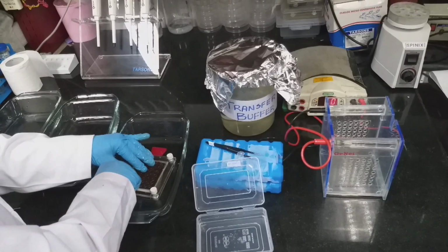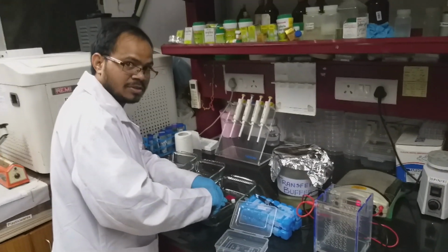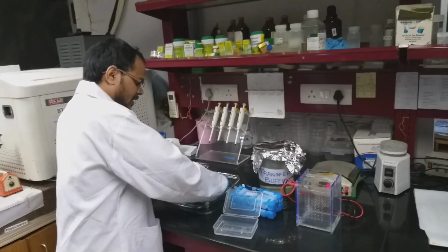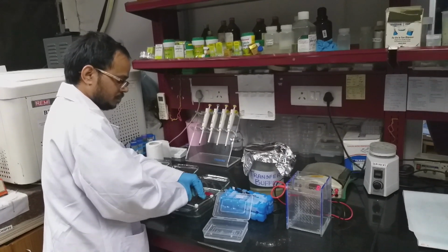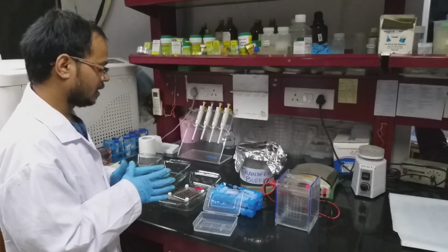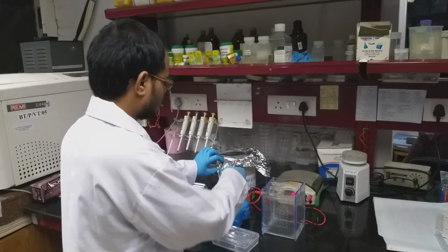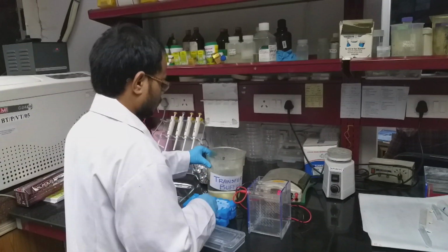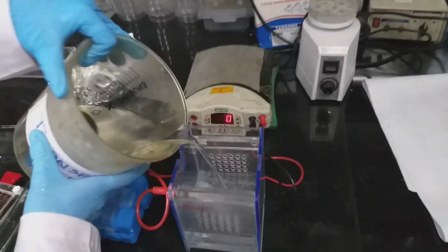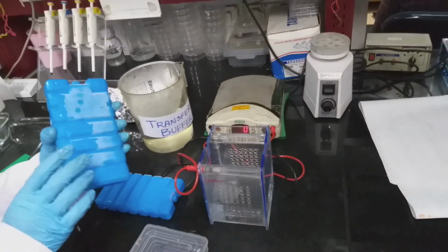Initially you don't tighten, you just keep it, and after that press the positive side of the cassette, then tighten the screws. All these things should be done in the transfer buffer only, unless specified. So this is the chilled transfer buffer. Now we are going to do the transfer. Pour sufficient buffer. Keep this ice pack also.